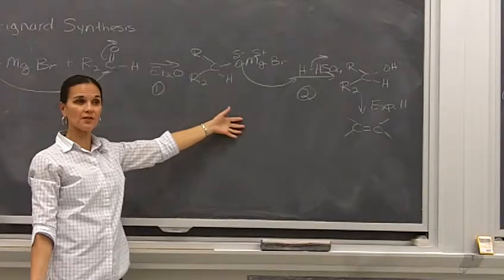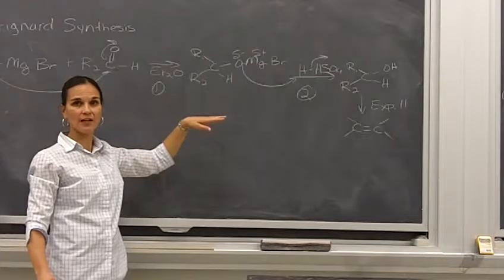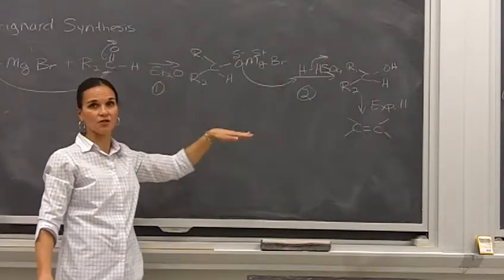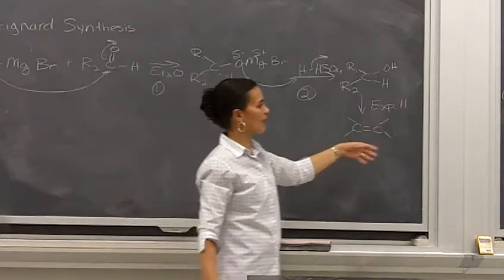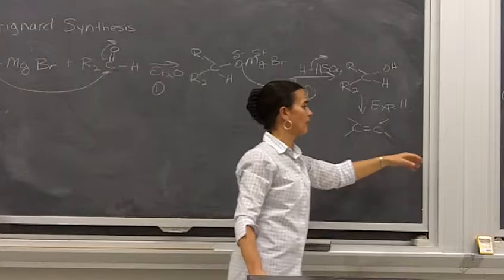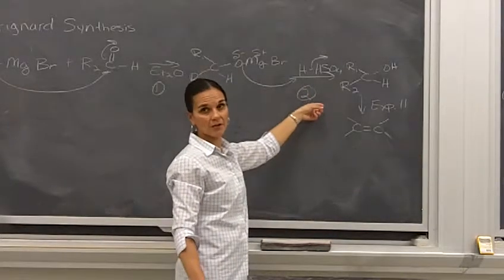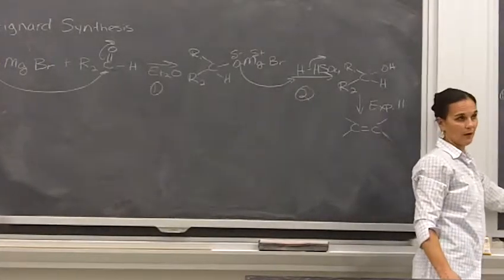And 9 molar sulfuric acid is just half dilute concentrated sulfuric acid. Concentrated sulfuric acid is 18 molar, so all we did is cut the concentration in half. So it's still really acidic, all right? You're going to make a solution of that and get that ready for the workup of the reaction, okay? So get that going during your stir time, all right?